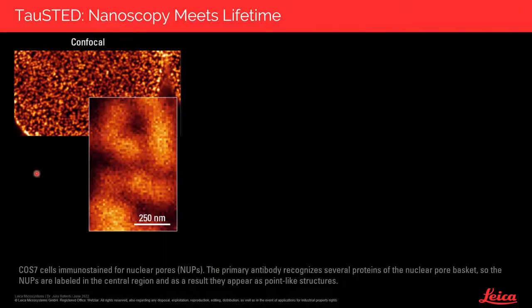And I selected as complementary modality our latest approach to STED, with the aim of characterizing further the endocytic vesicles. And this is inspired by a unique combination of STED and lifetime in our system, and that is what we call tau-STED. And before we go into the application example of the vesicles, I want to explain to you why we developed tau-STED.